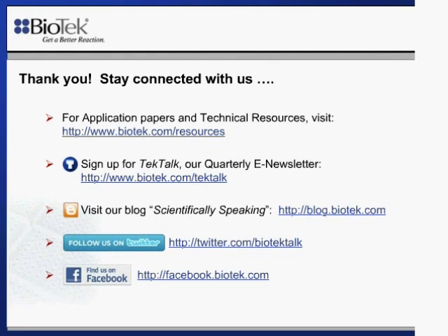That would be interesting to take a look at, I think, as we did with the phenol and the guanidine hydrochloride. It'd probably be worth spiking samples with those and seeing what kind of spectral analysis we get first of all, and see if that is going to be a problem.